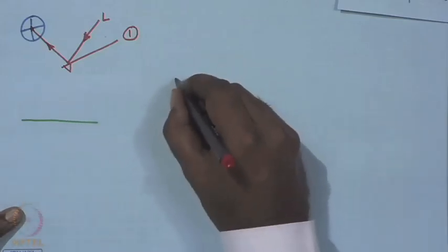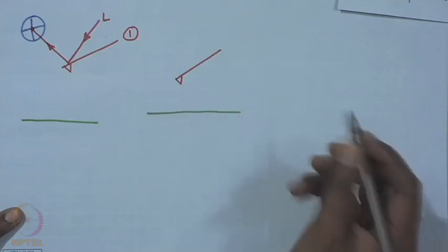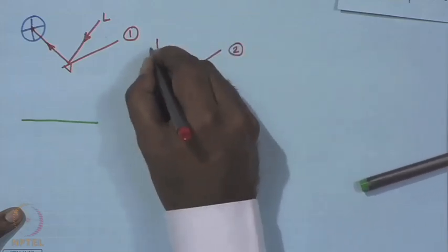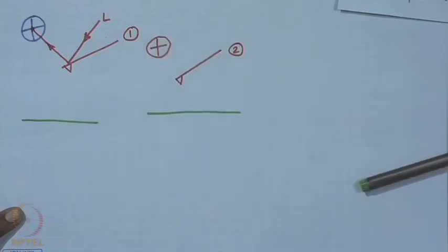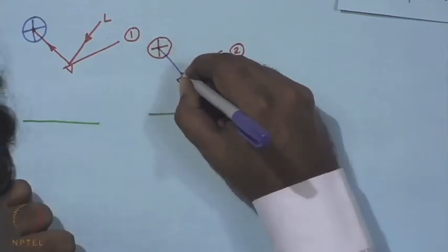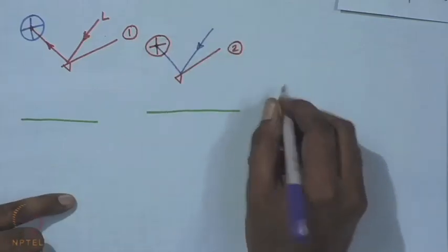At 2 it is closer, but still there is no interaction, as we have talked about. So, on the QPD there is no change in the position of the laser light, it still falls at the center.